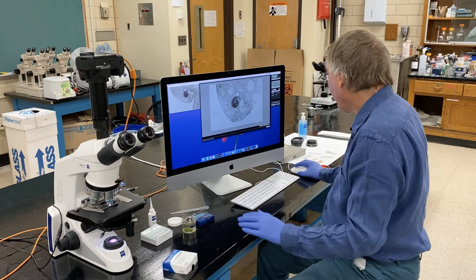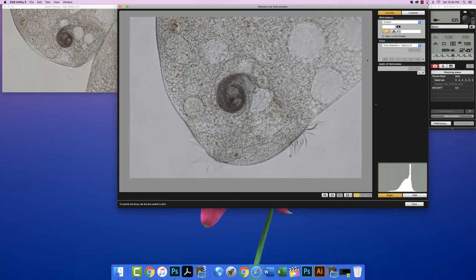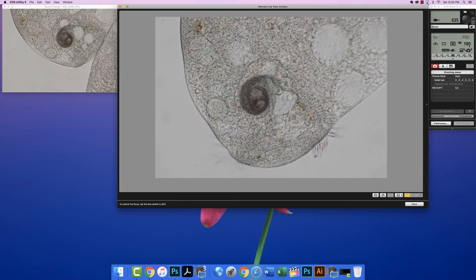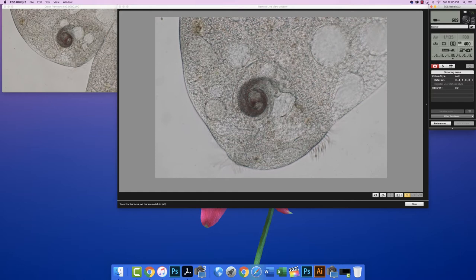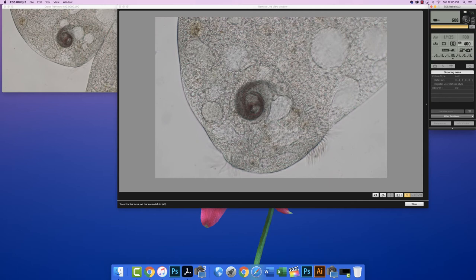I'm going to first check my white balance, and then close the window, and now I'm going to go up in ISO. I'm going to try 400. 400 gives me 1 over 125, which is what I want. So I'm going to stop there. I'm going to take a photograph. There we go.